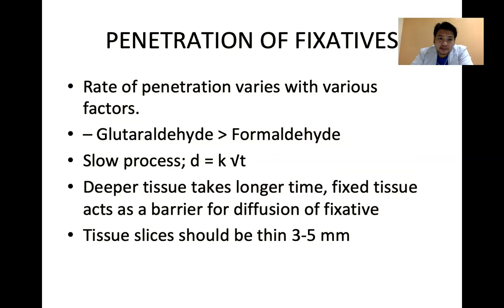Penetration of fixatives. Okay, the rate of penetration varies with various factors. For example, glutaraldehyde versus formaldehyde. For penetration, glutaraldehyde is said to be better. The only downfall for glutaraldehyde is that it is more expensive, okay? But same output. Okay? Deeper tissue takes longer time.